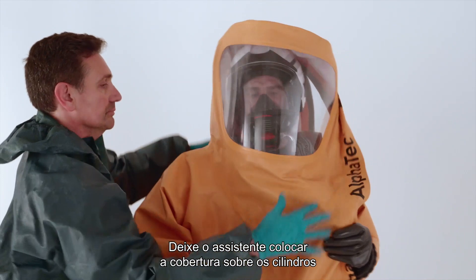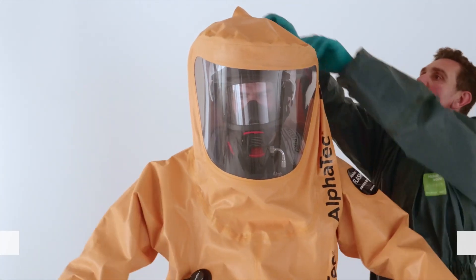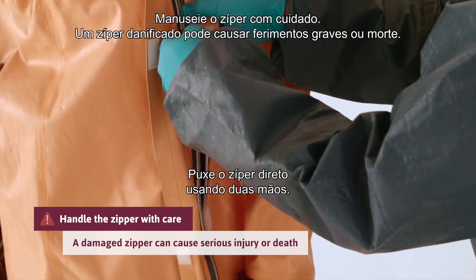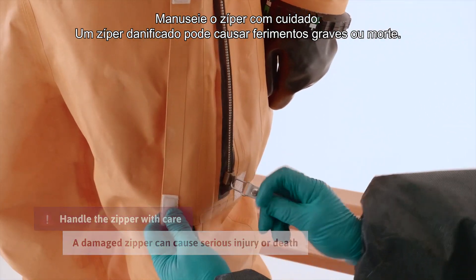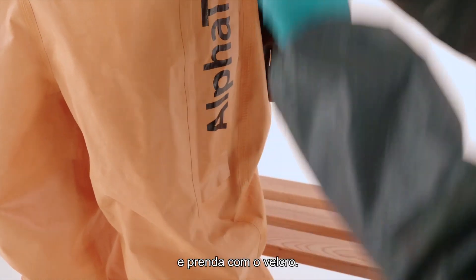Let the assistant pull the hump over the cylinders and the hood over your head. Close the zipper. Pull the zipper straight using two hands. Make sure the zipper is fully closed. Fold the splash guard over the zipper and secure with the Velcro.